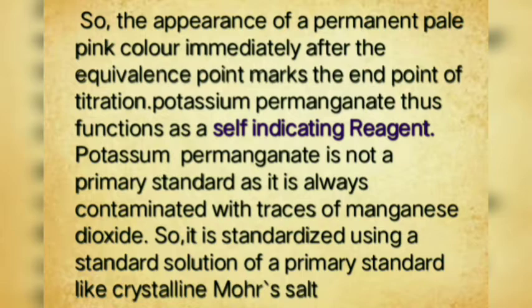Potassium permanganate is not a primary standard as it is always contaminated with traces of manganese dioxide. So, it is standardized using a standard solution of a primary standard like crystalline Mohr's salt. Let's perform the standardization part.